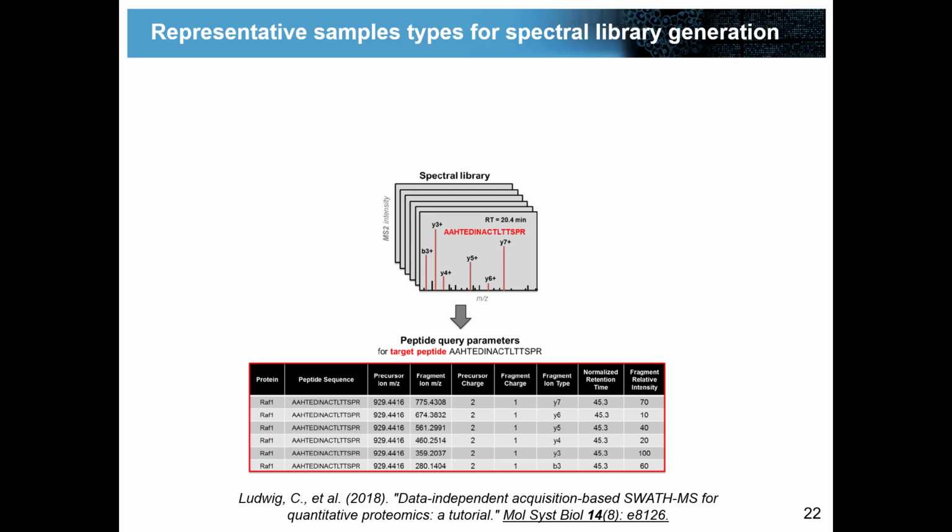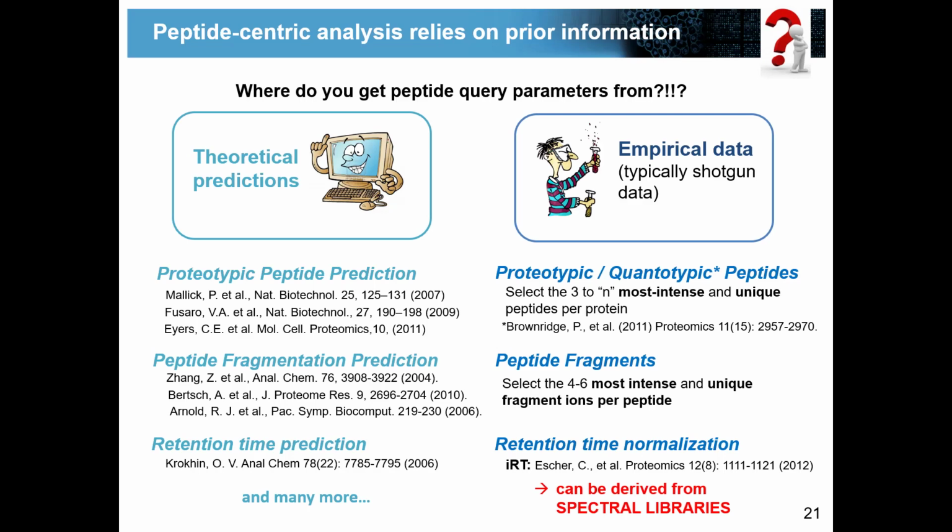About the fragments. If you put all the effort into selecting the peptides ideally, wouldn't it also be possible to go down with the amount of fragments per peptide to improve multiplexing capacity? Yes, you can go down, right.